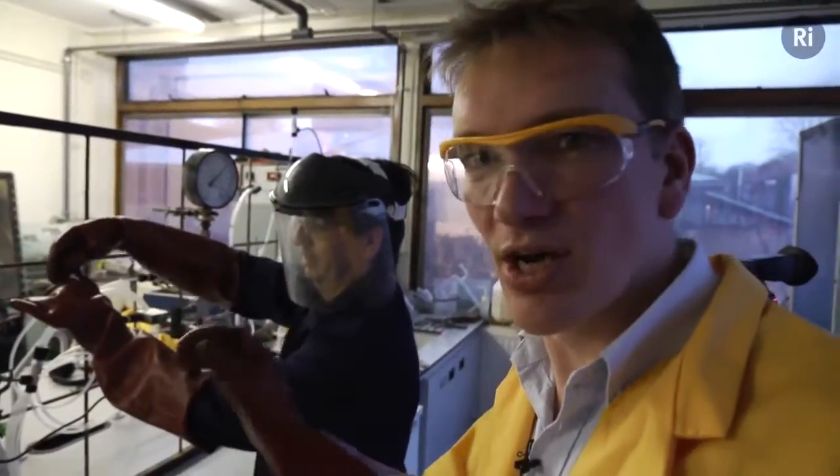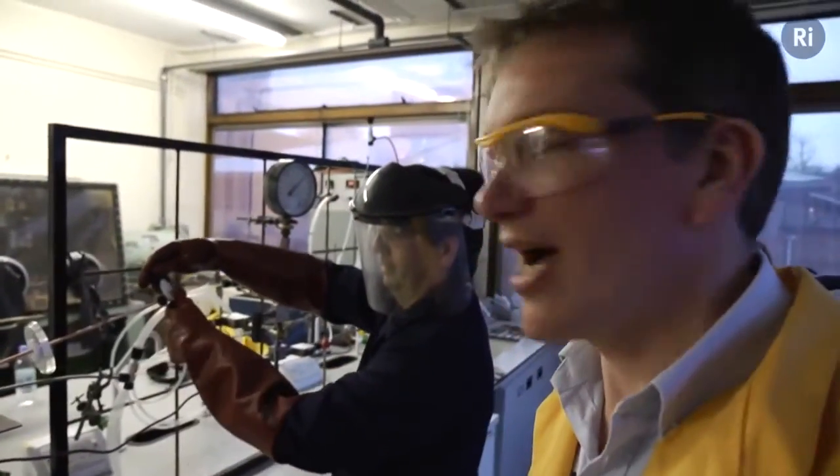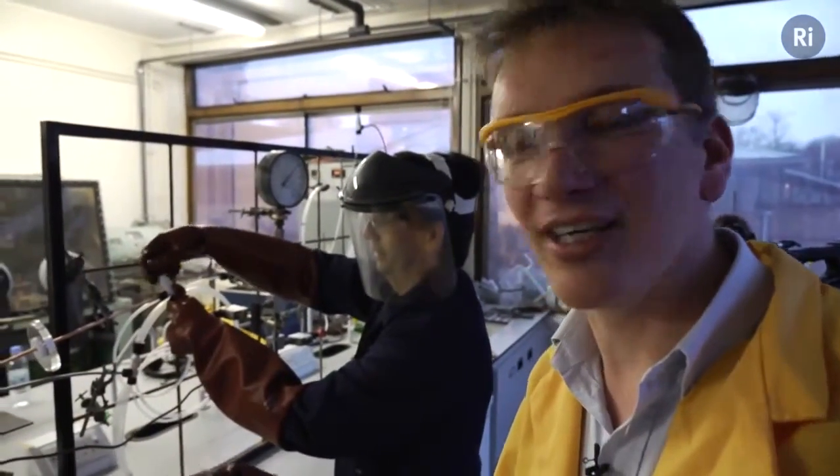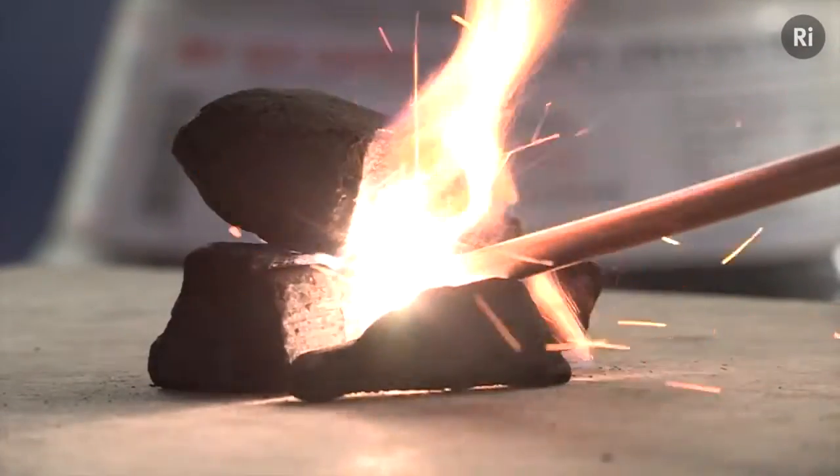This demonstrates the extreme reactivity of fluorine gas. This was a tiny quantity of fluorine being played onto the surface of the charcoal, and as soon as the two came into contact, there was a very violent reaction that generated a lot of heat, as you saw from the flames.